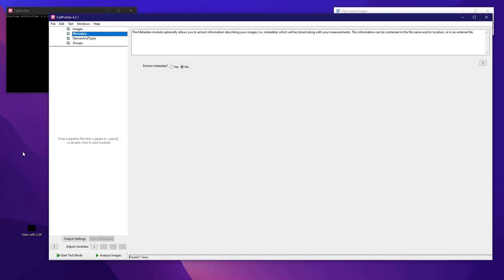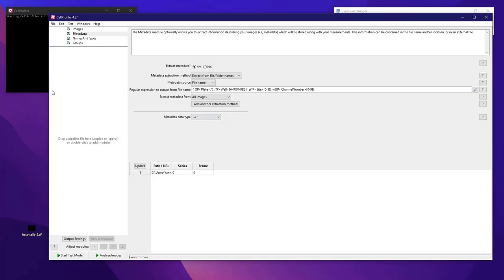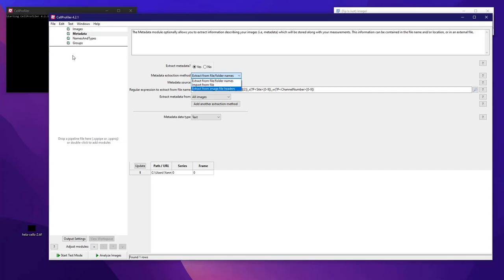The next step is to extract some metadata from this image so that you can organize the channels, slices, time points if it's a time series, and so on. Here I will choose to extract the metadata. You can do it from the files, from the names, import from an external file, or from the image file headers — which is my personal favorite, since working with microscopy files, most of the time you get everything you need already written inside the header of the file.